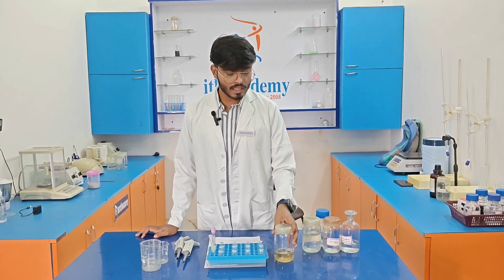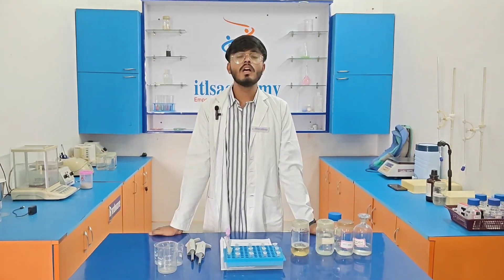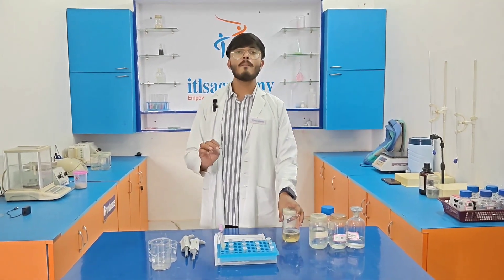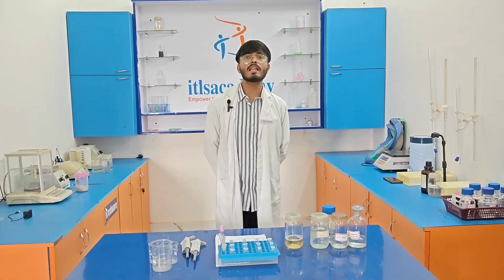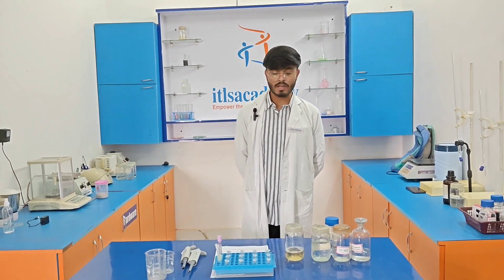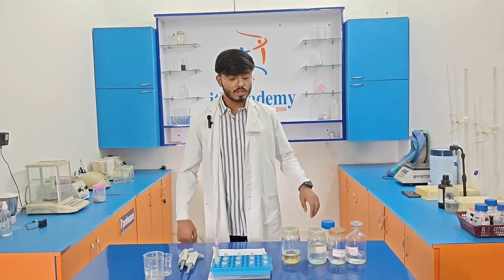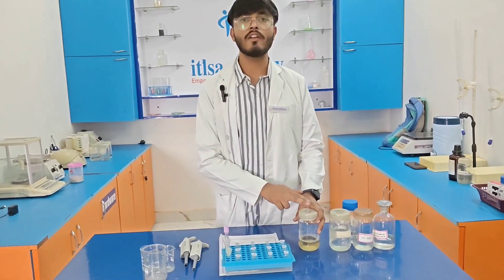The composition of lysis buffer is sucrose, Triton X-100, magnesium chloride, and Tris buffer. We require 10.96 grams of sucrose, 1 ml of Triton X-100, 100 mg of magnesium chloride, and 140 mg of Tris base. This composition is required for the preparation of lysis buffer in 100 ml.